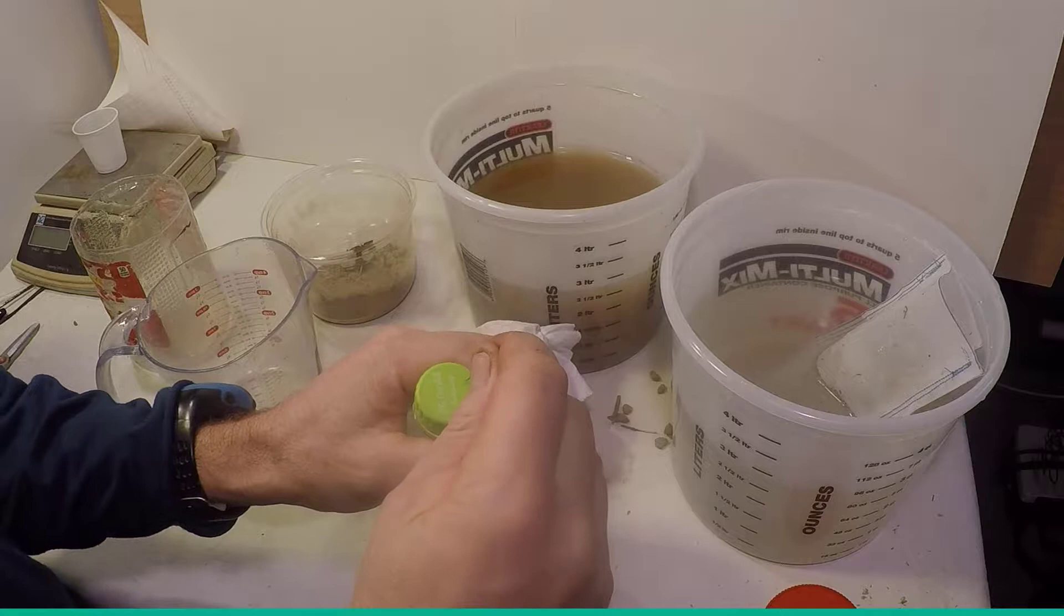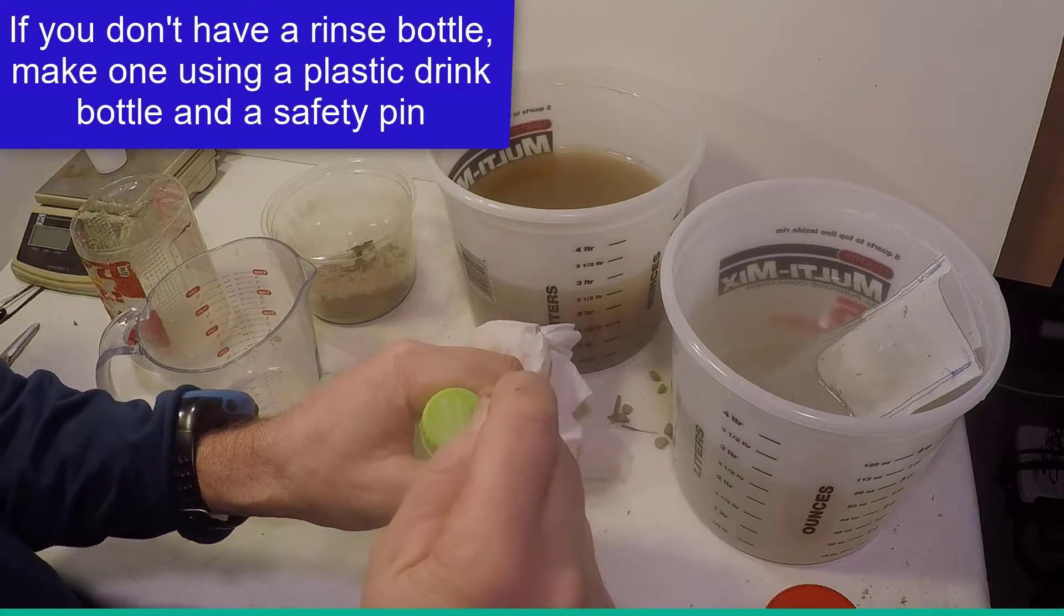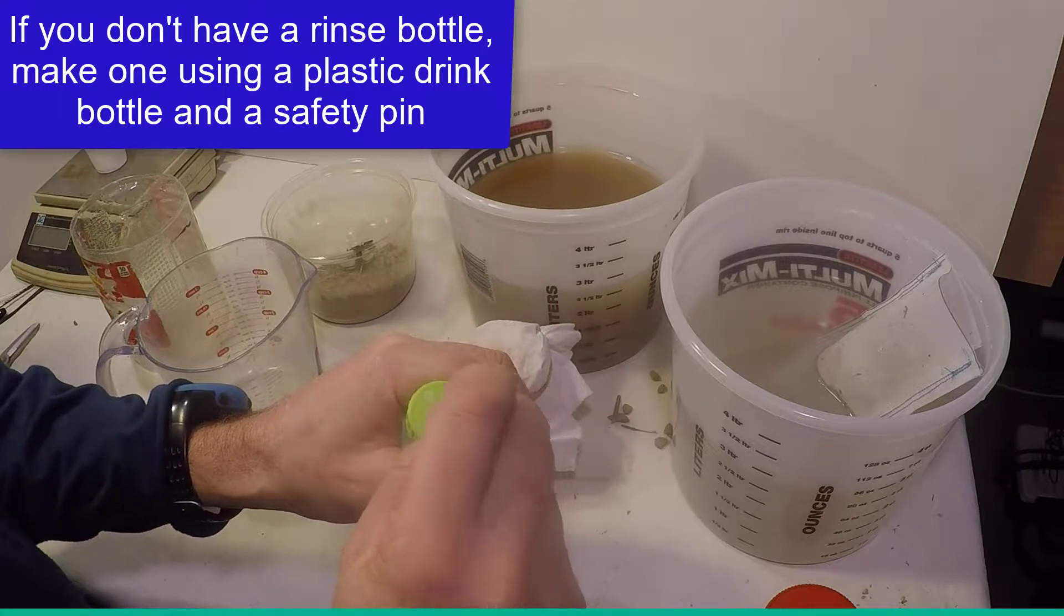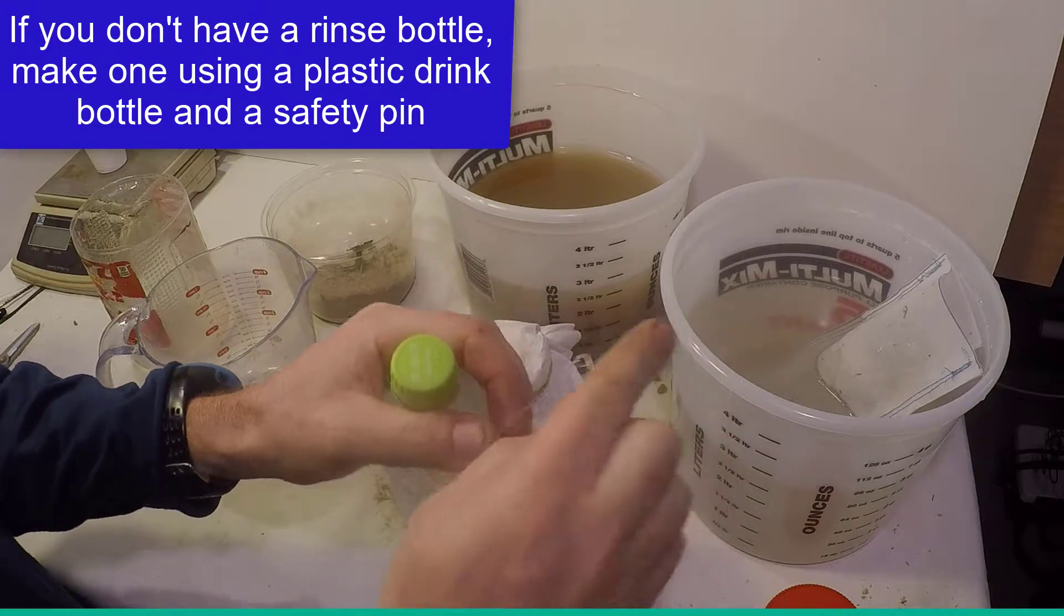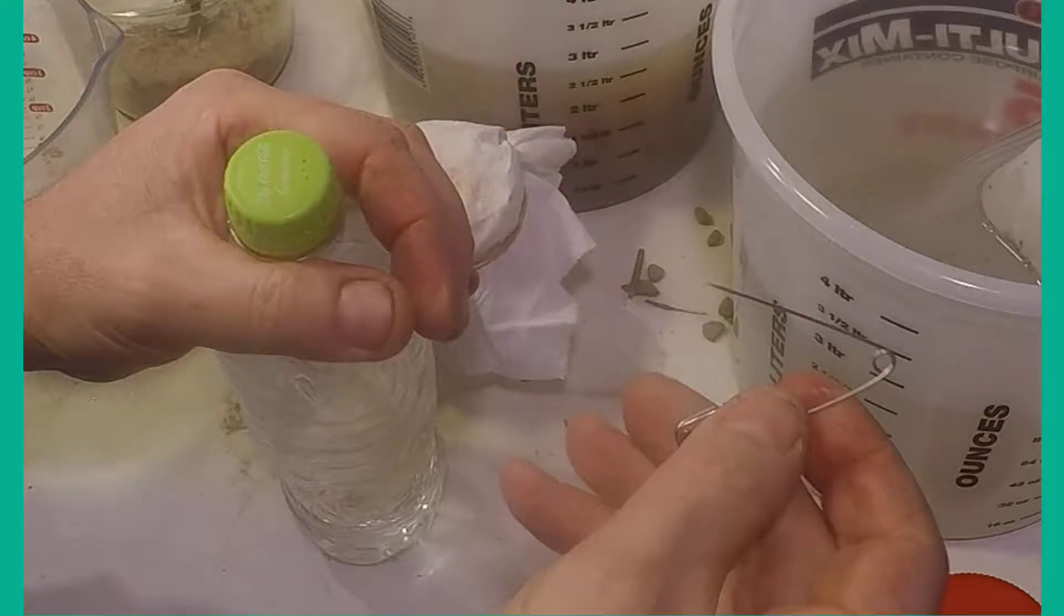You will also need a simple rinse bottle to move sand and organic matter around. If you don't have one, you can make a very effective one by punching small holes in the top of a flexible plastic drink bottle.